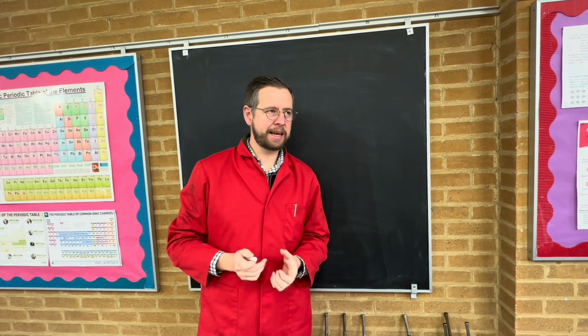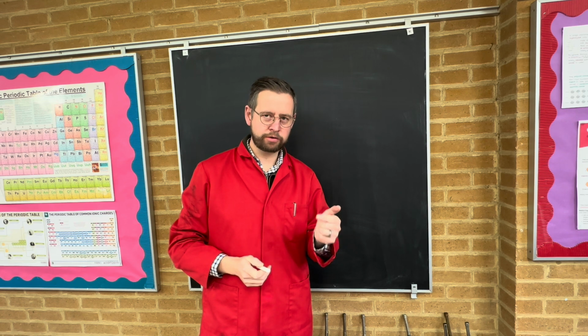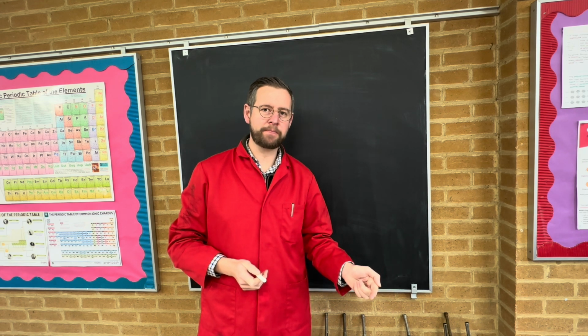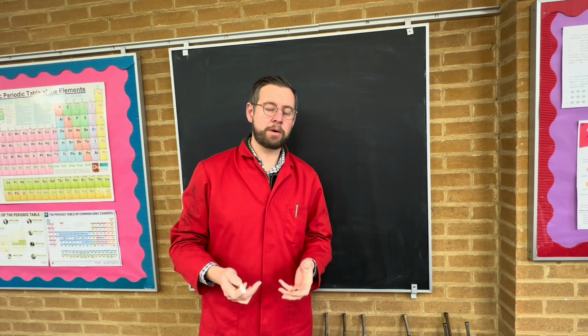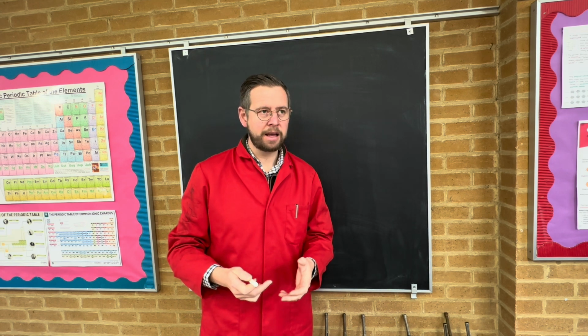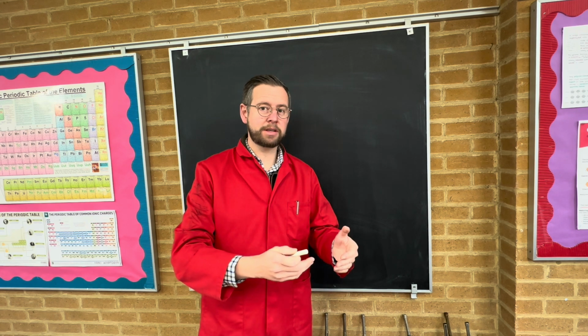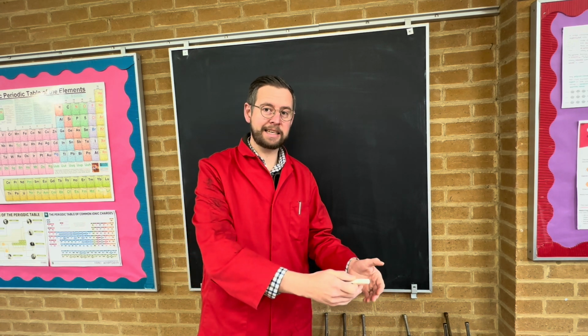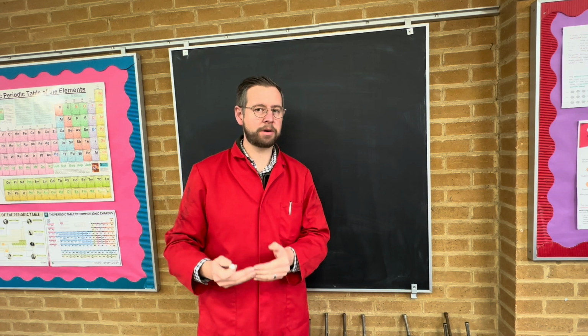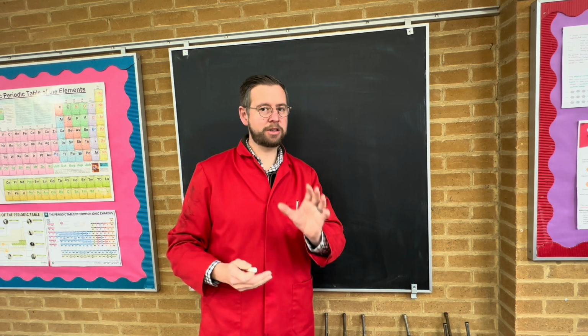Basically, in this PAG, I want to see how the concentration of hydrogen peroxide changes with time. So I need to know what the concentration of the hydrogen peroxide was. Now I'm going to use the amount of oxygen gas collected to tell me what the concentration of the hydrogen peroxide is. Now, let me show you how this works.